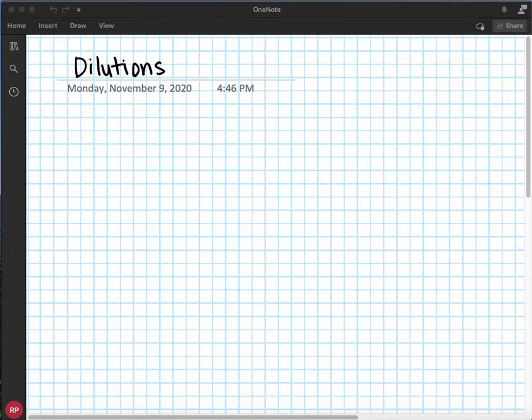It's Ruby. I'm going to be going over how to pick a dilution, how I personally pick dilutions for ELISAs, how to calculate out my dilutions. There are many ways to do it, but I'm going to show you, work out the math, how I do it, and then at the end, diverging a bit from ELISAs but still working with dilutions, how to do a really dilute concentration for something like a BCA assay.